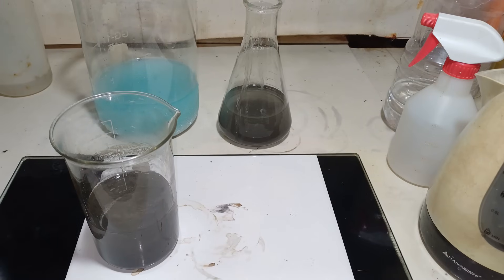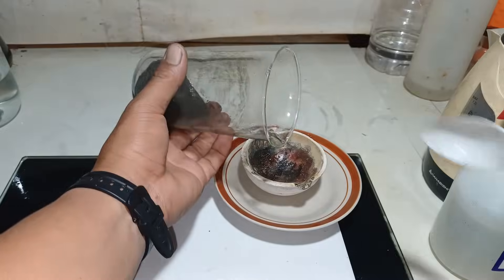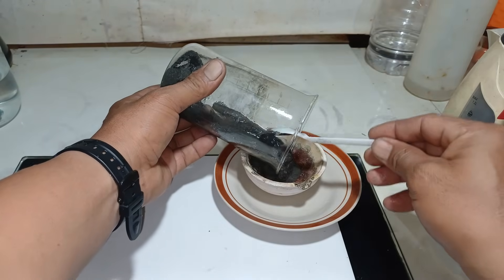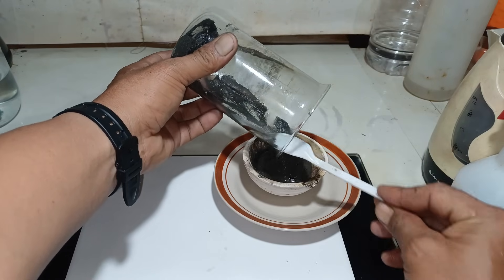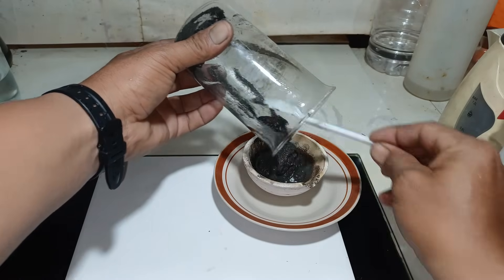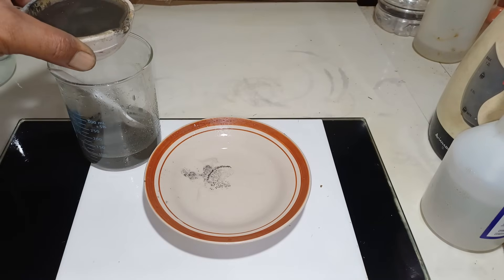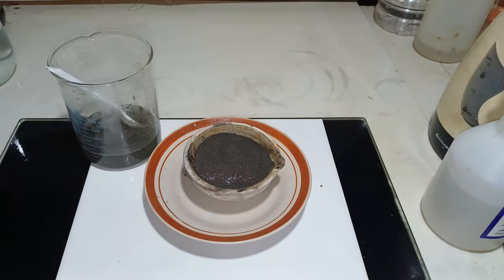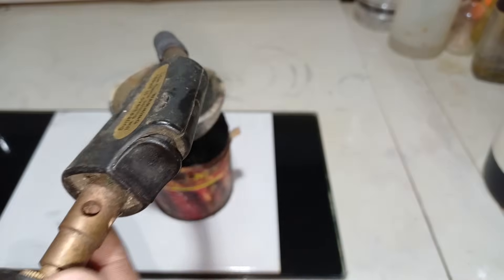We remove the water here to melt our silver. We add our silver to our melt dish — lots of silver here. We remove the remaining water. We are melting our silver using our self-ignition torch.